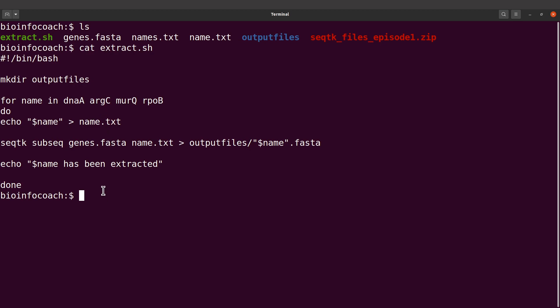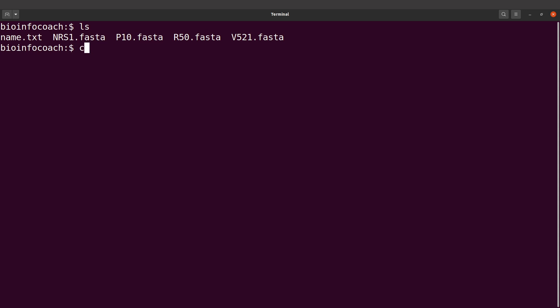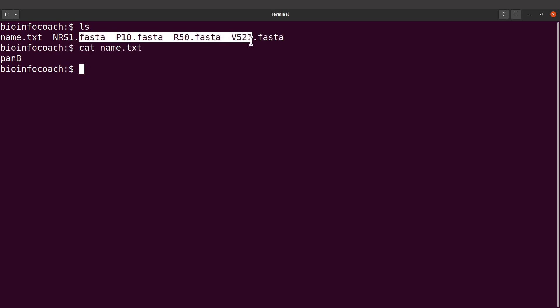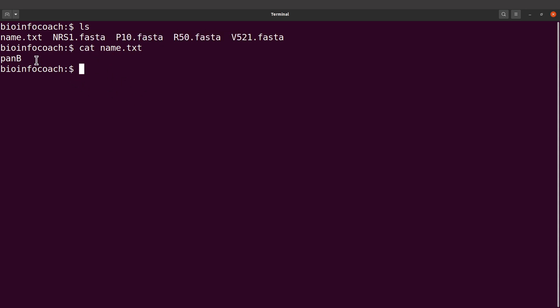It is also possible to extract a single sequence from multiple FASTA files. I have four FASTA files here, and the gene of interest is here — these are Staphylococcus aureus strains. This gene can be found in all the strains listed, so it is possible to extract the sequence of this gene from each of these files and place all of them in a single output file. This approach is useful if you want to perform a multiple sequence alignment and generate a phylogeny tree. I've covered a tutorial showing how to do this in Python — check the description box for the link.